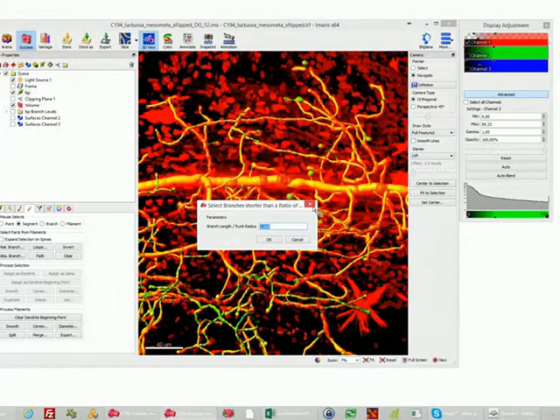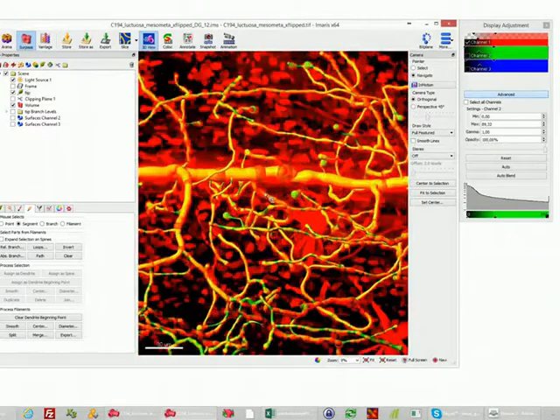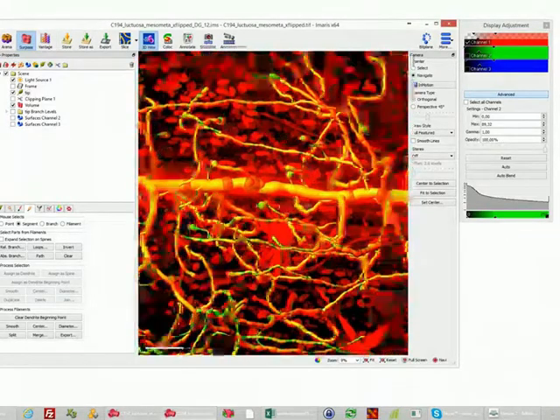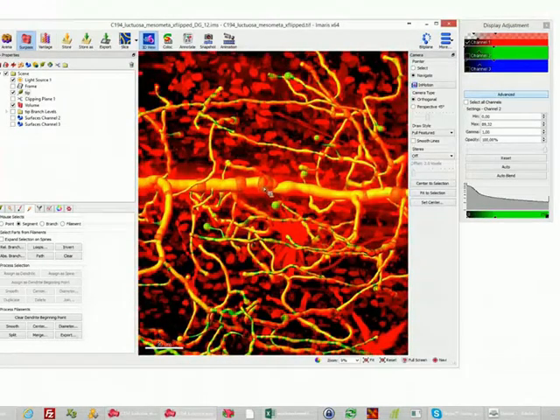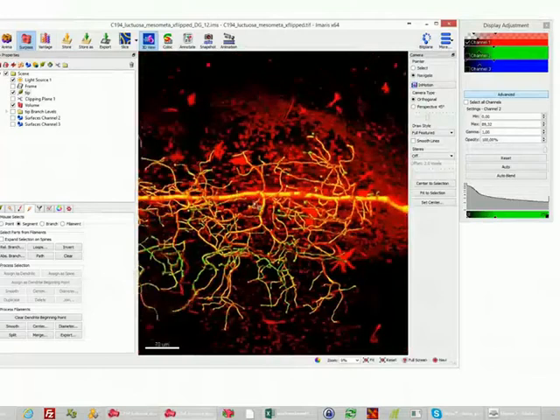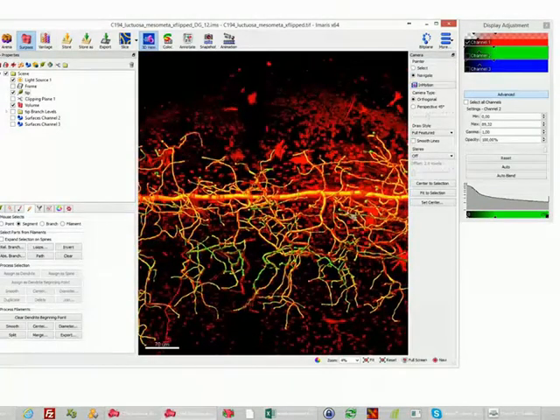It's a ratio as well, which depends on the diameter of the branch where they spring off. So this was done then more generally, so that basically that will select small branches on the full data set, and then in the end you just press delete and delete them all with one stroke. So this is quite automatic.